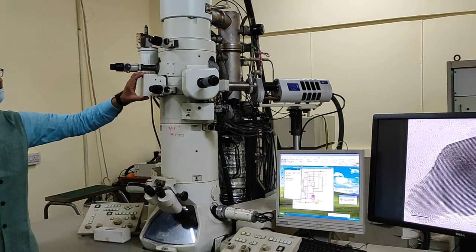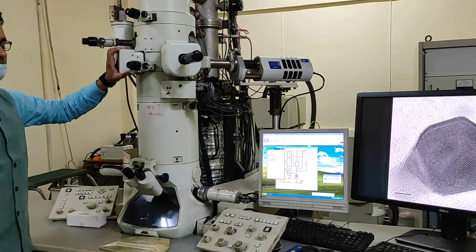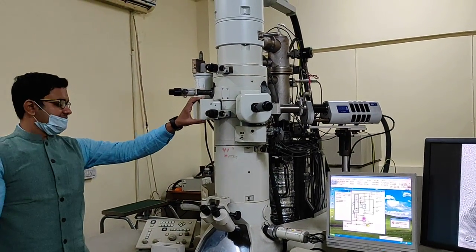by creating vacuum in the path of the beam with the help of pumps. This is the turbomolecular pump, ion getter pump, and roughing pump.